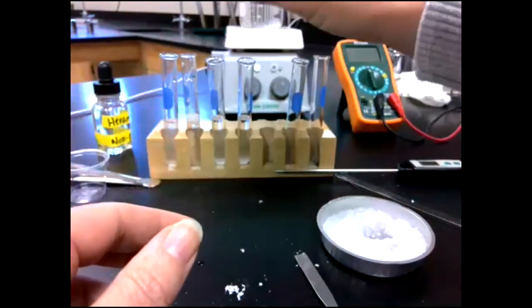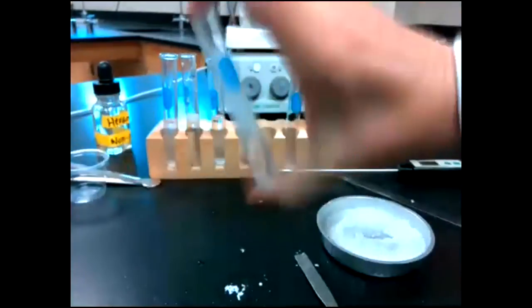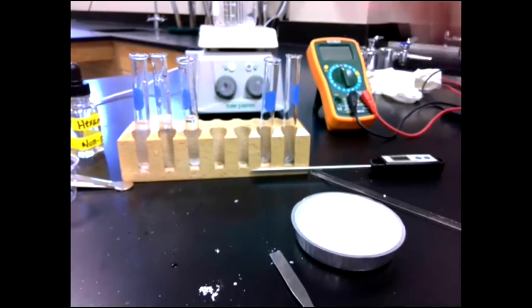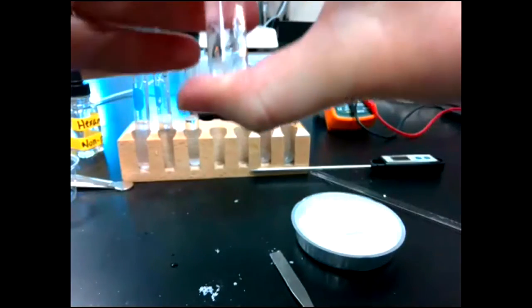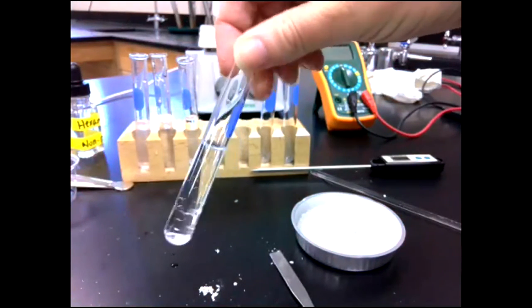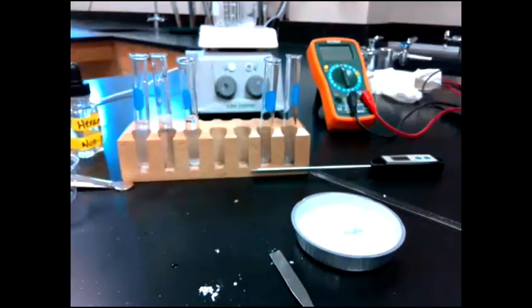And then this is B in hexane. Okay. And this is hard to tell right away. There's still some left. The pieces are smaller. I'm gonna keep going.